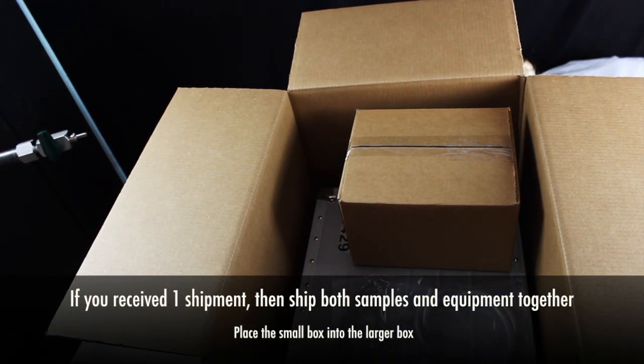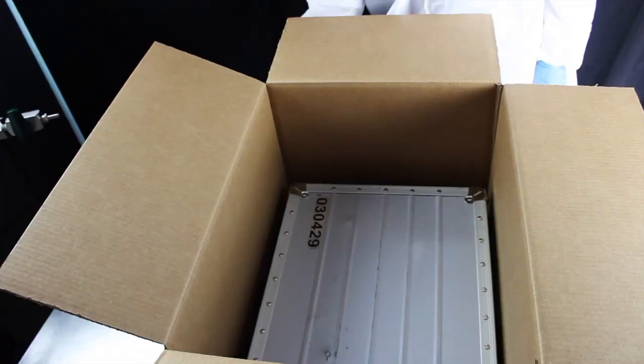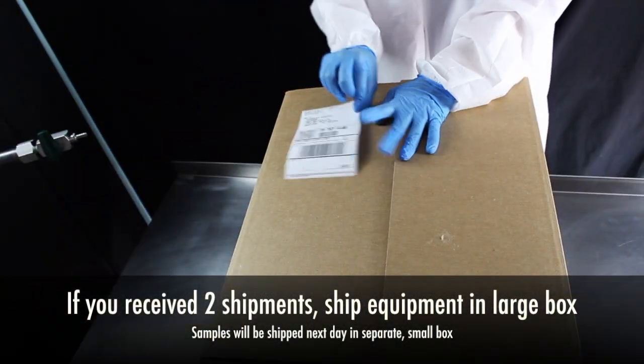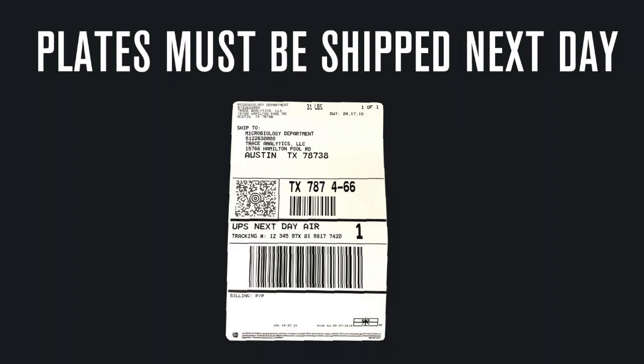If you received one shipment, then the equipment and samples will be shipped back to the laboratory together. If you received two shipments, the plates in the small box will be shipped separately from the equipment. Your sample plates must be shipped next day. Don't forget the next day shipping label that was provided in the small box.